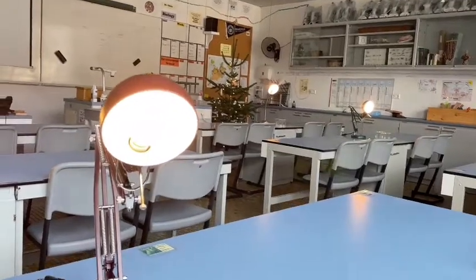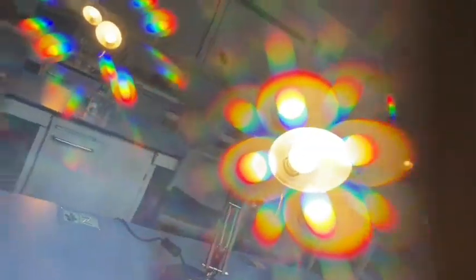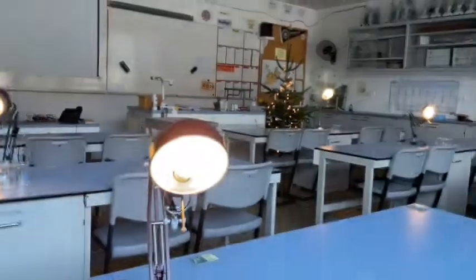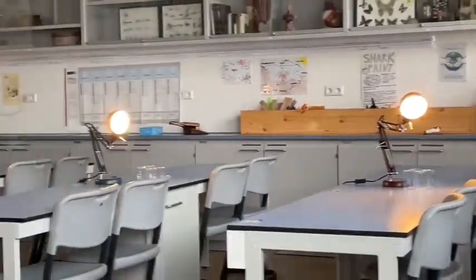In fact, we already demonstrated this by using little diffraction gratings that we put over their cameras, and they realized that all of light is separated into the spectrum of colors that they know as the rainbow. With that knowledge, you can use this experiment to test all sorts of things. How do different colors affect the rate of photosynthesis? Might be something interesting that they can test underneath these lamps using some different filters.